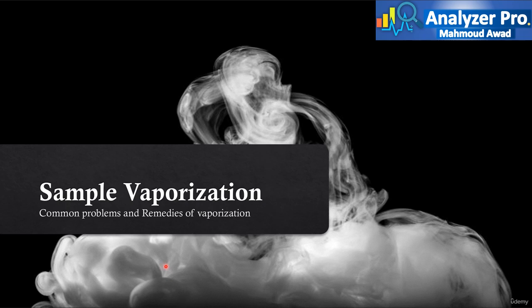In this lecture we will learn the common problems and remedies of vaporization. Phase diagrams will enable you to approximate temperature, pressure, and flow settings, but some troubleshooting will still be required. One sure indication of a problem is poor repeatability in analyzer results.